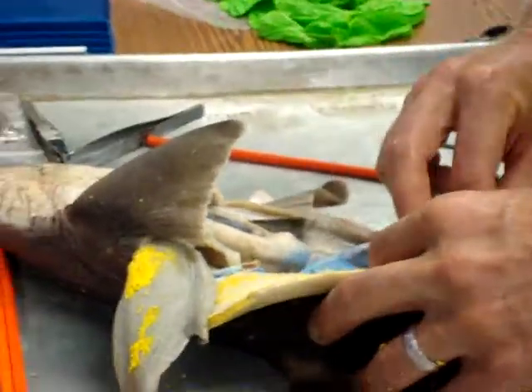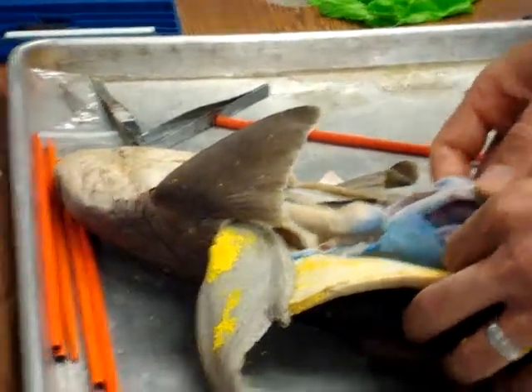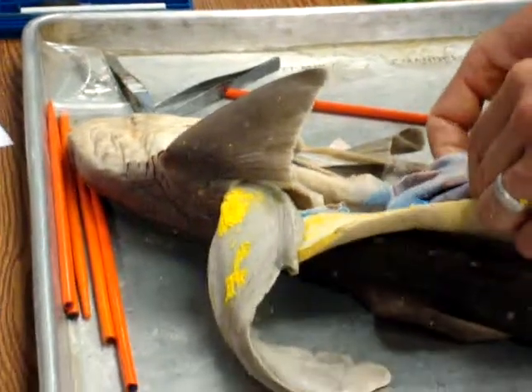It would be part of the circulatory system that provides blood to these organs. Are we going to have to remember all these things for like a test or something? Not necessarily, no. Thank you. Alrighty, so we have the spleen. Now it gets kind of interesting.